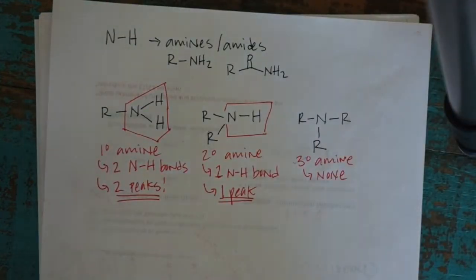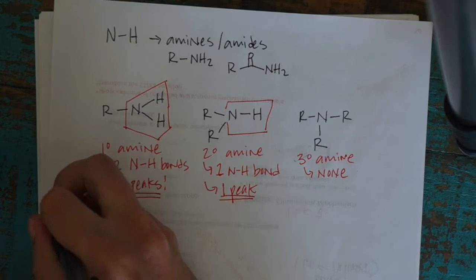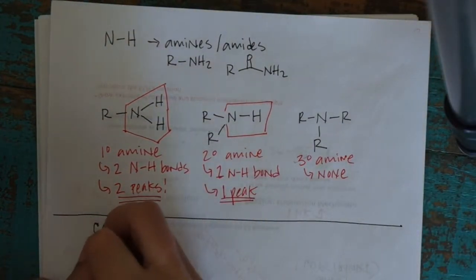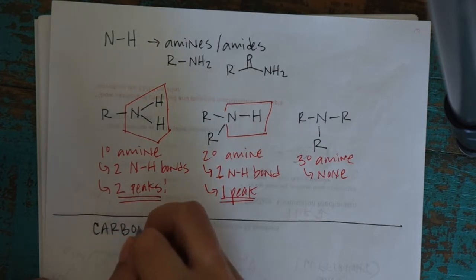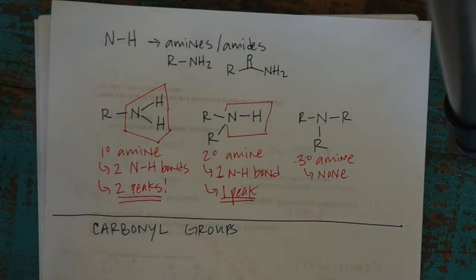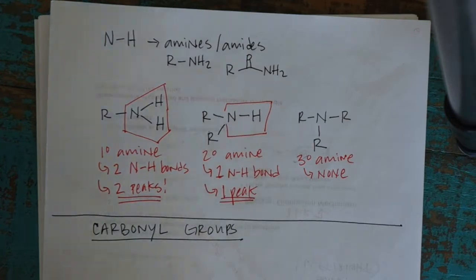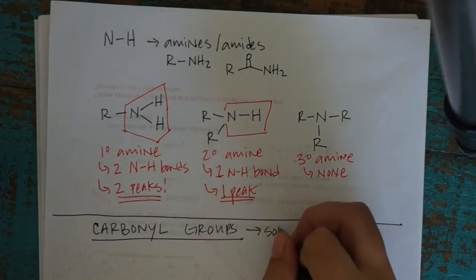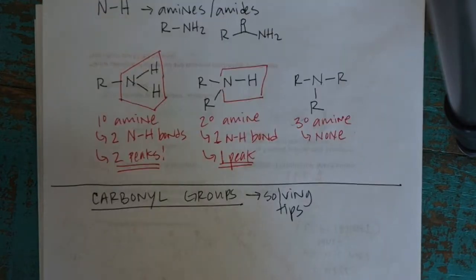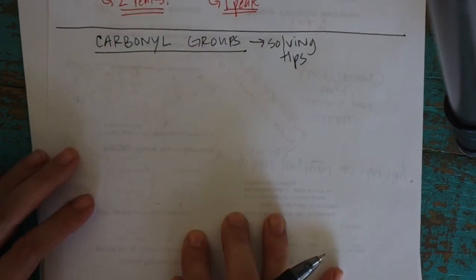But before we end the lecture, I wanted to give some tips for talking about and differentiating carbonyl groups in the IR. So these are solving tips for that. Okay, so to go through this, again, there's similar things in the IR that you'll see.